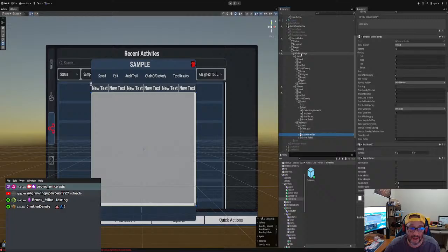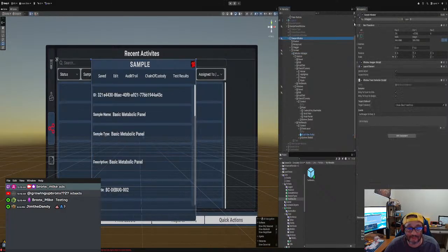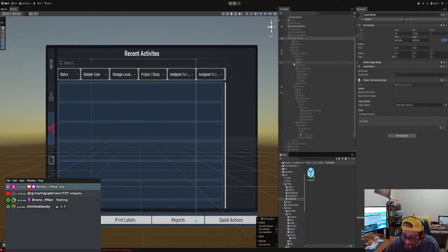All right, so now we go back here and we just reset this, right? And then we turn off this window and see if we could actually get some data. We're not going to get any data, but hopefully we get some data. If not, what we're gonna do, we're gonna write a script for Supabase, and then we're gonna say, hey, just fill it up with random data. That's pretty much it. But I'm not gonna do it. I'm gonna ask AI to do it.